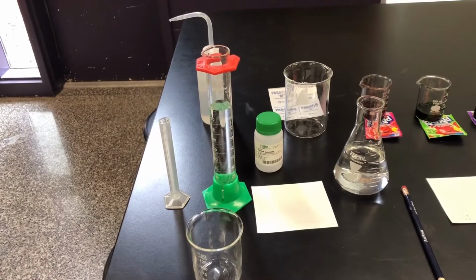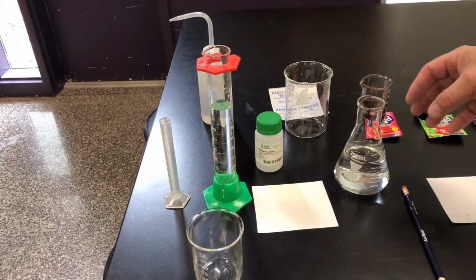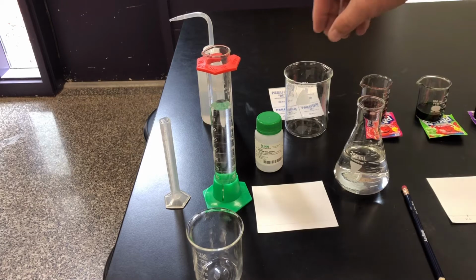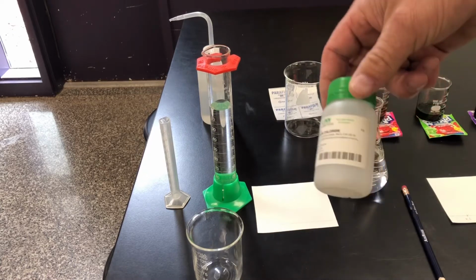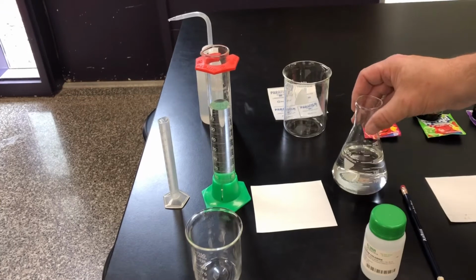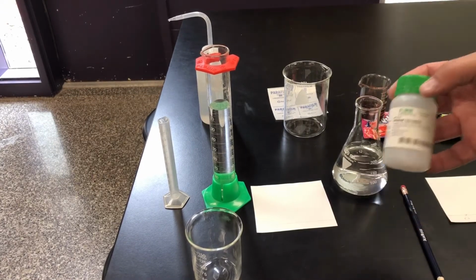Onward to our solvent. Our mobile phase solvent is going to be a 0.1% sodium chloride solution. You kind of have to bear with me on this. What we have here is 2 grams of sodium chloride. We've already measured out 200 milliliters of distilled water.